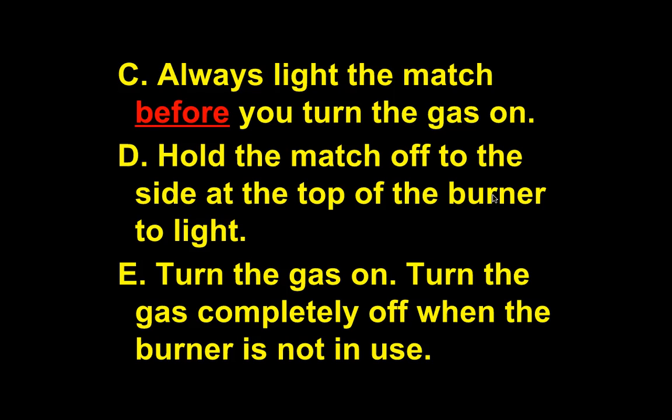Hold the match off to the side at the top of the burner, then slowly bring just the tip close. Turn the gas on and put the tip into the gas flow and you'll get a flame. Turn the gas completely off when the burner is not in use.